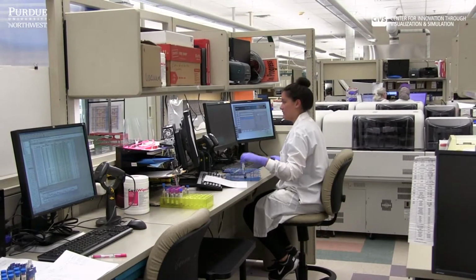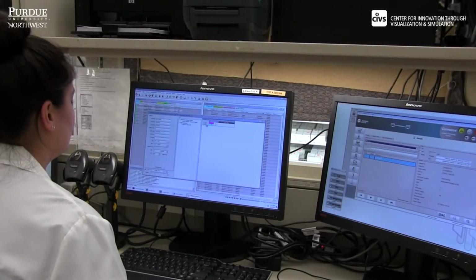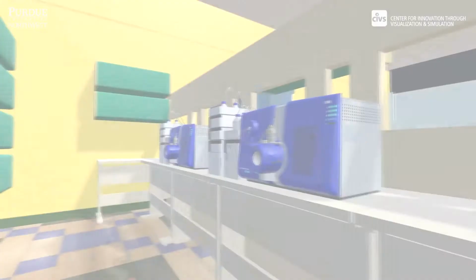Regardless of where the testing is done on the line, the technologists utilize Remisol to interpret and verify results. Remisol is the middleware between the analyzers and our laboratory information system. From a single workstation, techs release valid results to the LIS, which proceed to the patient's chart and enter the physician's electronic medical record system.